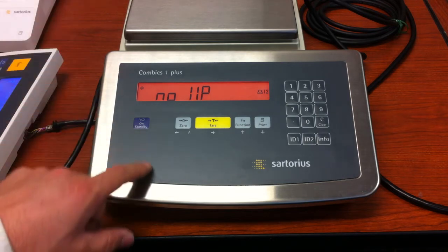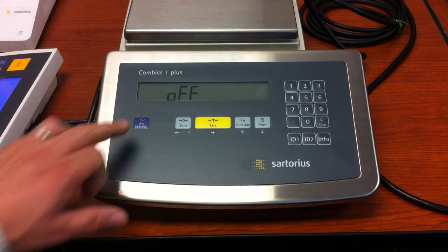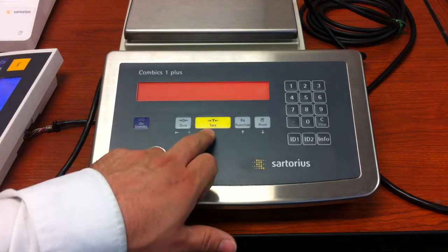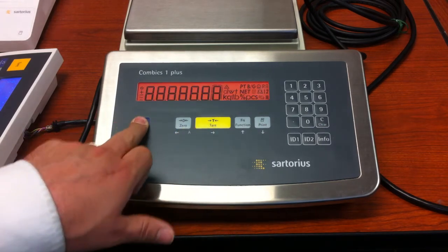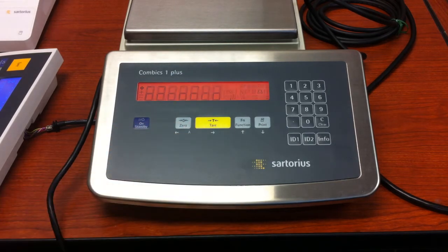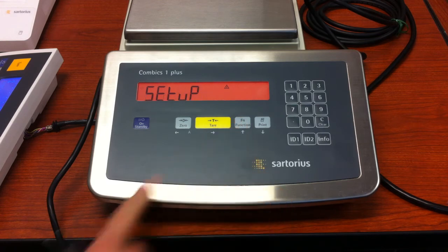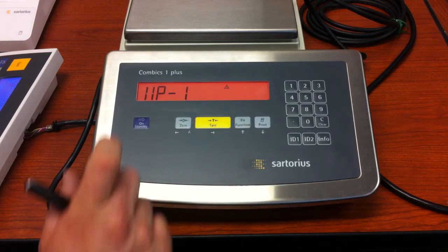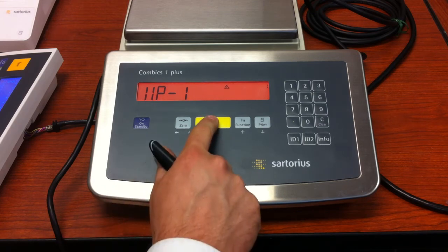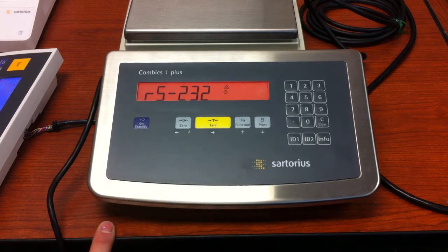We're going to go into the menu. Start with the unit off, turn the unit on, press and release the tare key during the segment check. At this point, press and release the function key until you see 'setup', press the tare key, go through WP1, and press the tare key again.